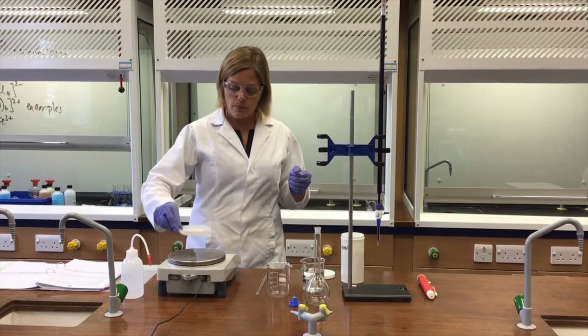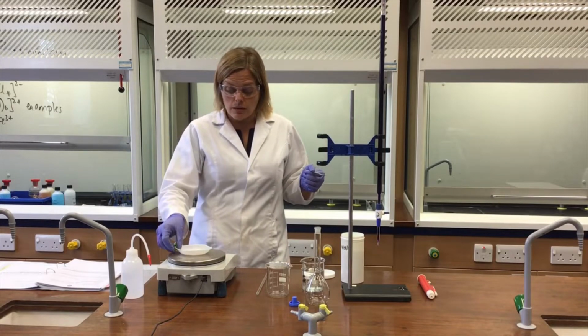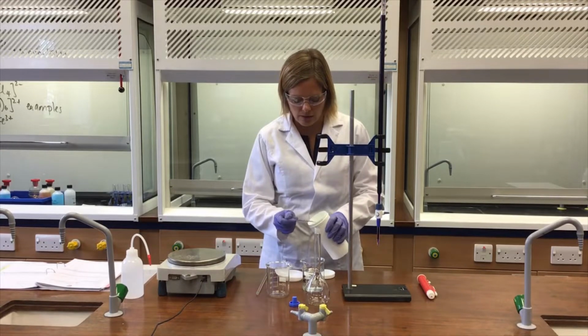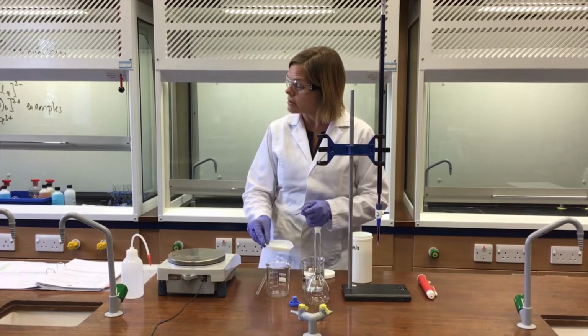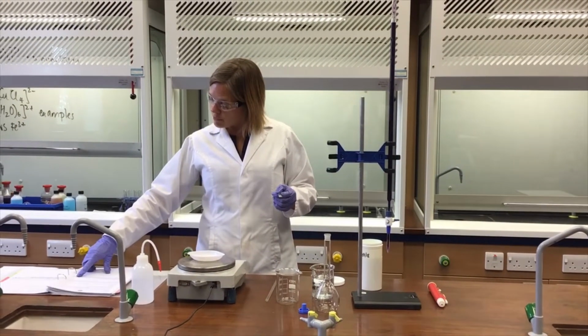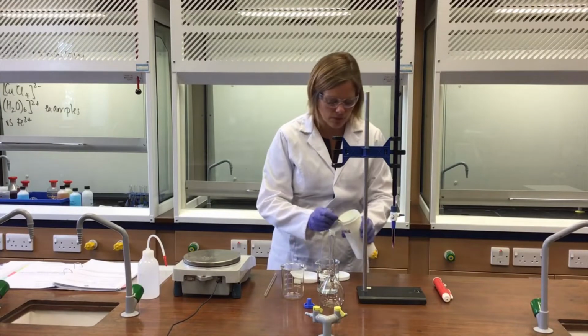So I added just one spatula load, so I can see what that looks like. That's 4.36 grams already. So another spatula load and a tiny bit, and we should be in the correct range. So I've got another spatula load and a tiny bit. Remember, oh, hang on a second, I need to add the 2.75 grams onto that. So I'm at 5.69 grams, I need the 2.75 plus about 10, so that's about 12.75, so I need a few more spatulas, that makes a bit more sense.